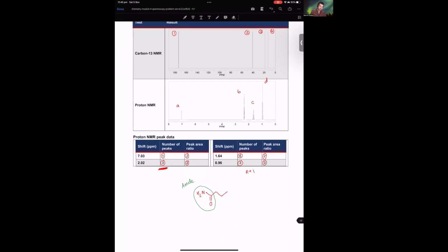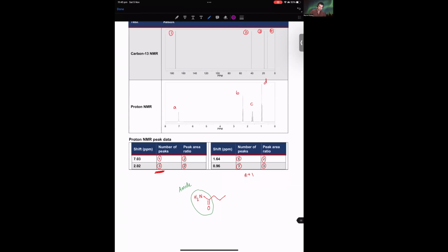So it is its own kind of functional group. So when we come to name this, or in fact, before I name this, I'll quickly add in the labels. So we can say that this is carbon 4, carbon 3, 2, and then that's carbon 1, the very highly de-shielded carbon. And then for proton environments, if we go to blue, we would expect this to be D, C, B, and then A is actually those protons in the nitrogen, as we've talked about.